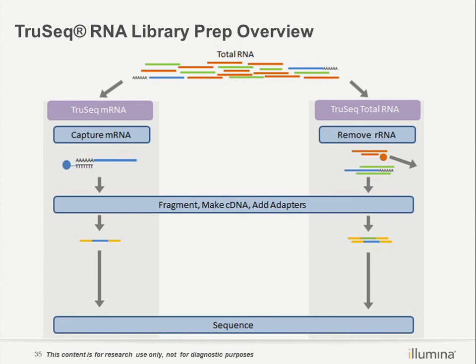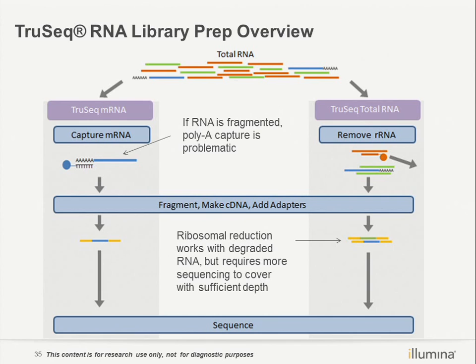Okay, this slide we have seen in previous slides: the mRNA solutions and the total RNA solution. For this one, we know it may face some limitations if your sample is FFPE. But this one is still the perfect one. Let's say there's not any perfect library preparation, only the most suitable one. For these kits, there is a problem: we only remove the ribosomal RNA, but a large number of non-coding RNAs are still kept in our library.